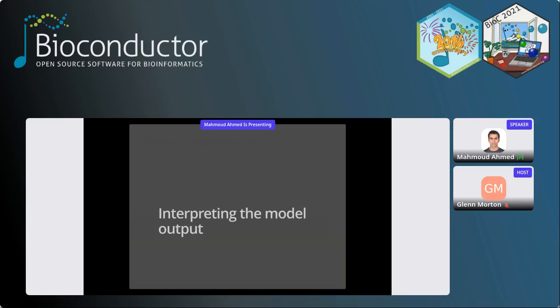So here the different slots contained in the object map nicely into the type of information that you can get from ChromHMM anyway. So I will explore it by going through the different accessors with the different slots.